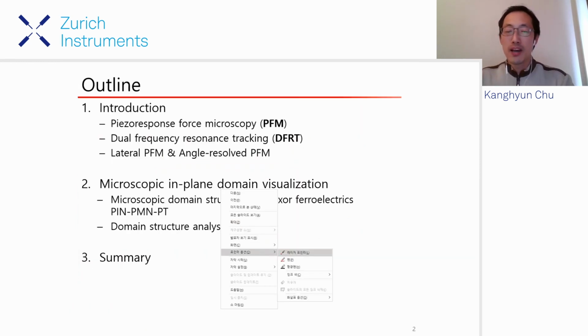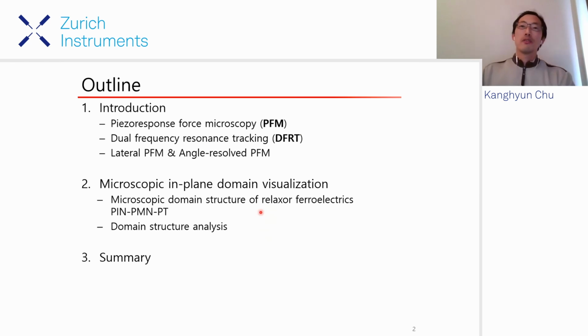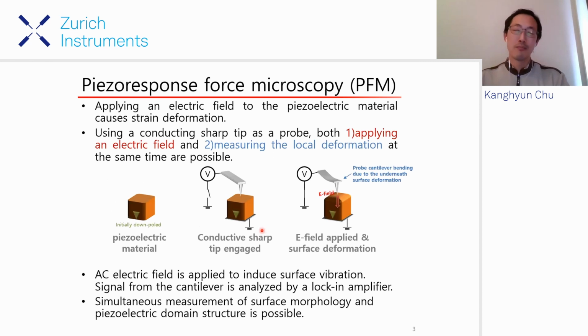So this is an outline of today's presentation. I'm going to briefly explain the basic principles of the PFM and the dual frequency resonance tracking technique, which was already addressed this morning, and the lateral PFM and the angle resolved PFM. And then I'm going to show you my work, and that will lead to the end of my presentation.